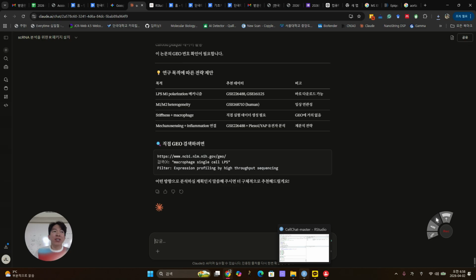There's some metric that's not that big, a few hundred megabytes, that's smaller.